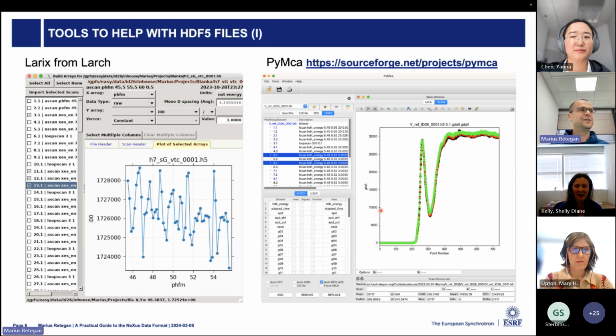Yeah, I think the transition from spec to this new acquisition system that we have was already quite a hard pill to swallow for some of the users. So I think they wanted to keep some familiarity with what they used to have before. Underneath, they're all Python functions, which essentially just write a title following the same format as it used to be in the past. But there is nothing related to spec in these files other than maybe the similar name.